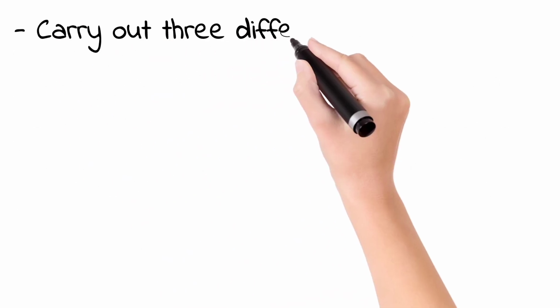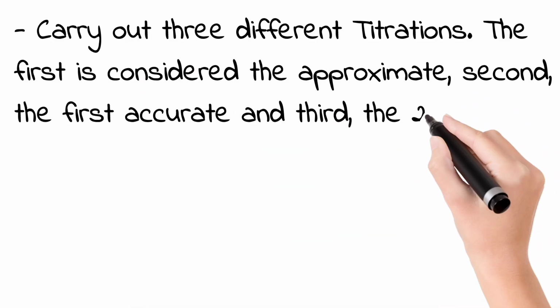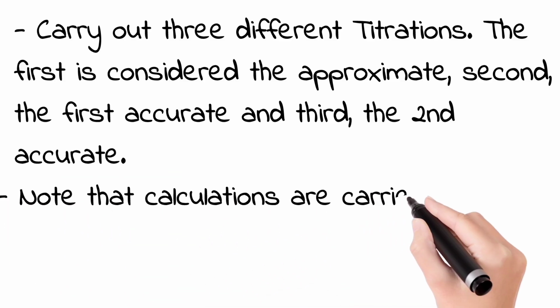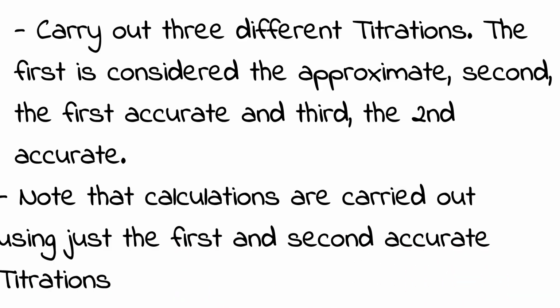After that, what are we going to do? We are done with our titration. We have had our initial burette reading and our final burette reading. We are going to carry out 3 different titrations. You follow this procedure 3 times. Now you get another conical flask. You pipette 25 cm³ of the standard solution into the flask, and then you refill your burette, and then you start titrating.